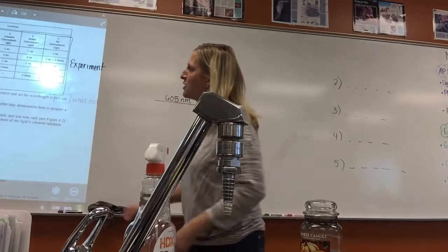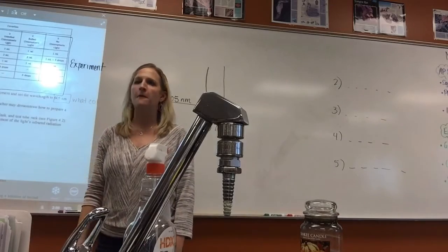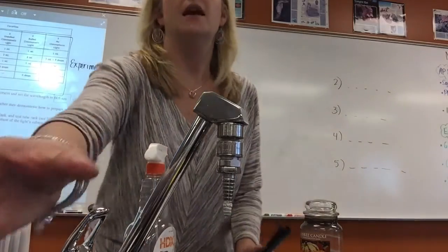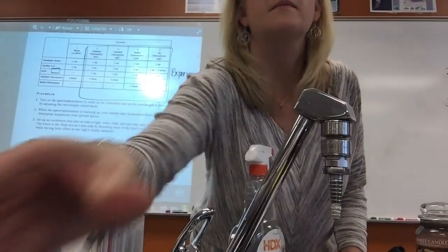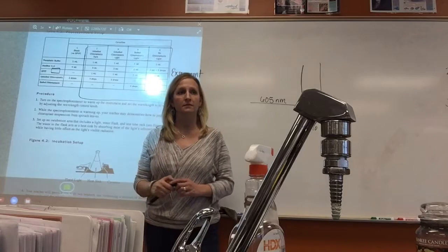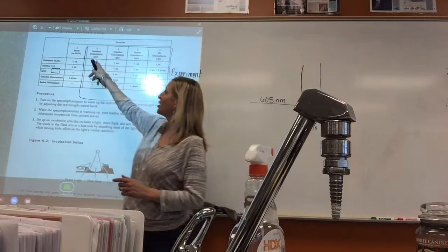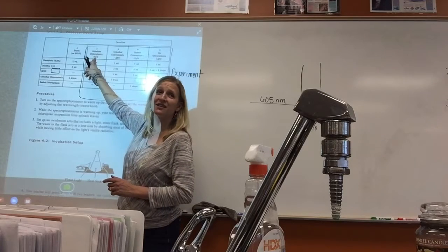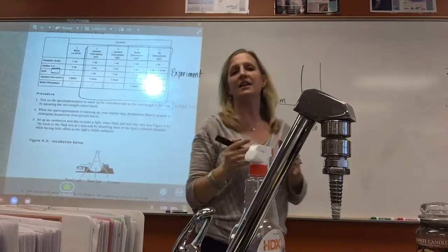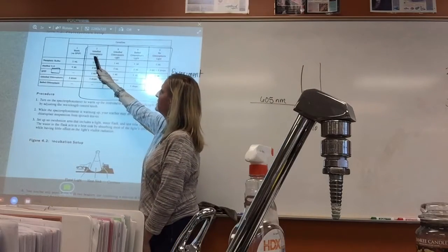If in that cuvette you're going to put unboiled chloroplast and we're going to keep it in the dark, what hypothesis am I testing? Well, it's in the dark, so this one is testing the light. To test whether or not light is present or needs to be present for photosynthesis to occur.